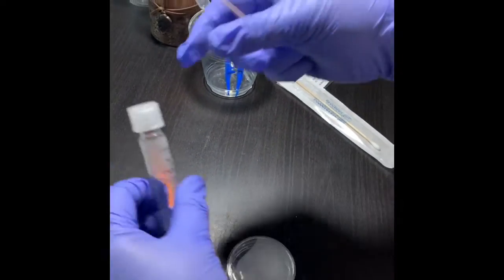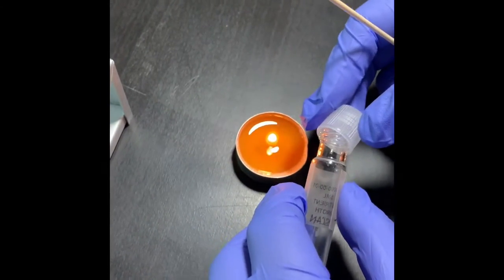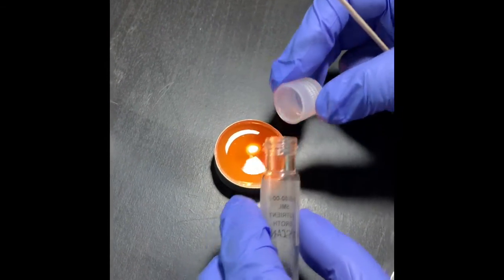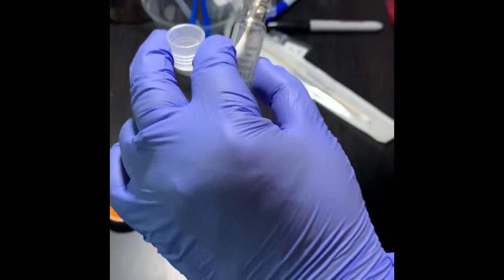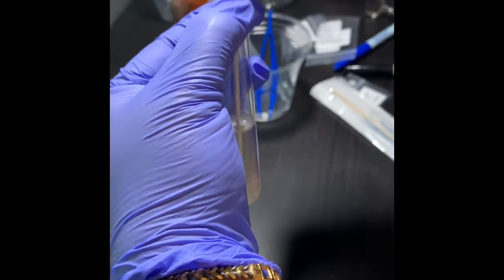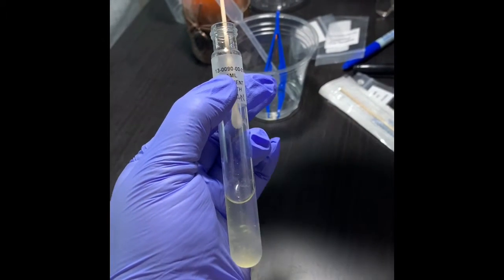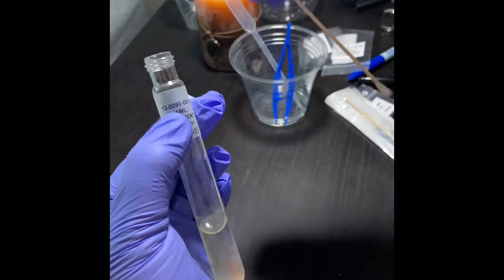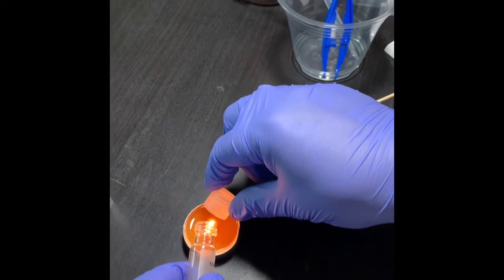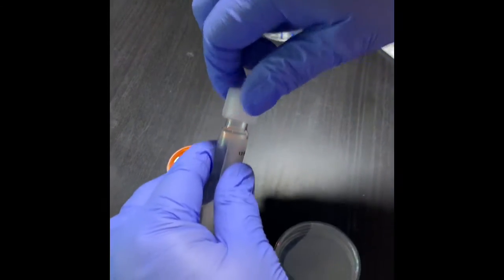Applying the aseptic technique, I put my cotton swab inside the human sample and mix, then take it out and close my tube in aseptic method and keep it.